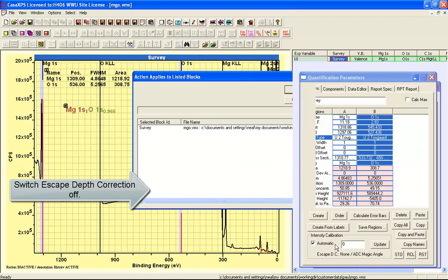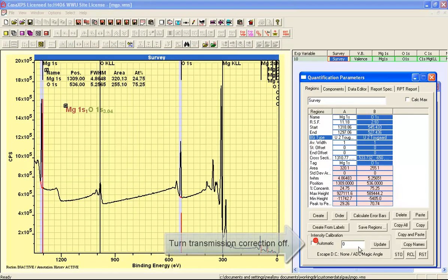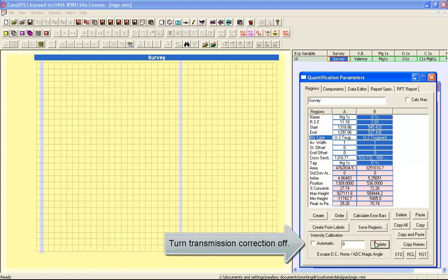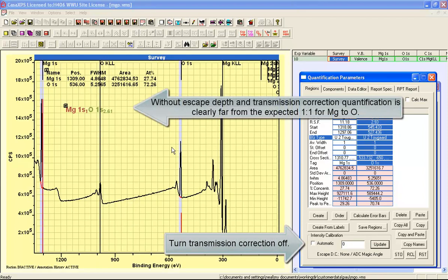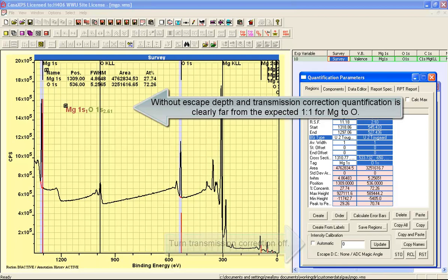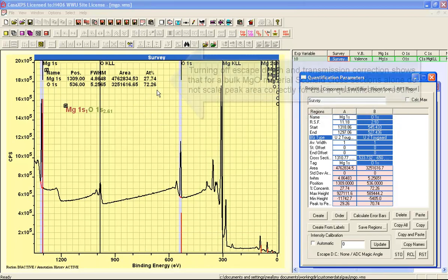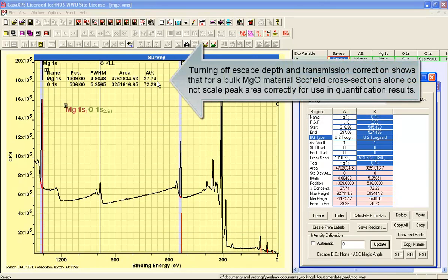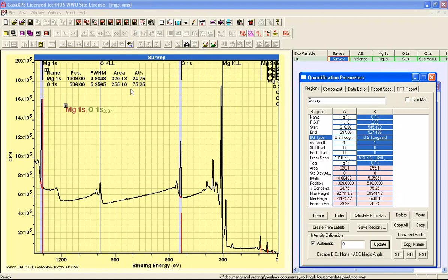And also I'm going to turn off the transmission function. And without the transmission function and without the escape depth correction, it's quite clear that the quantification that you obtain from these data are not the expected stoichiometry. If I add the transmission correction, the relationship appears to worsen in the sense that it's now 1 to 3 instead of 1 to 1.